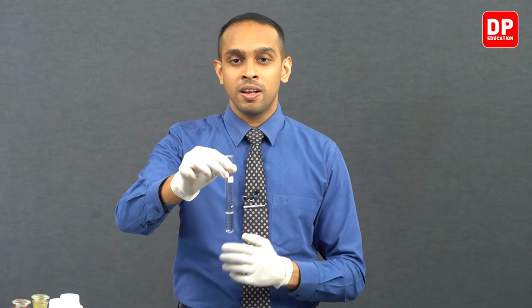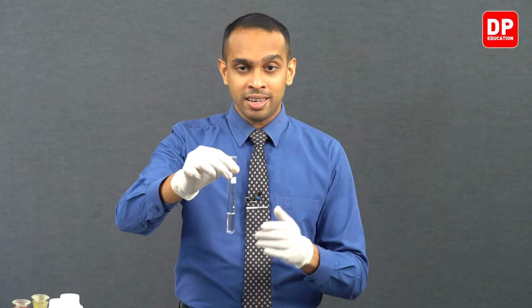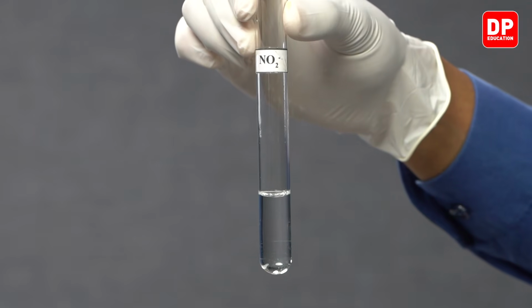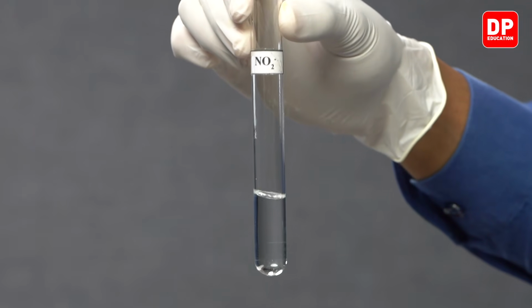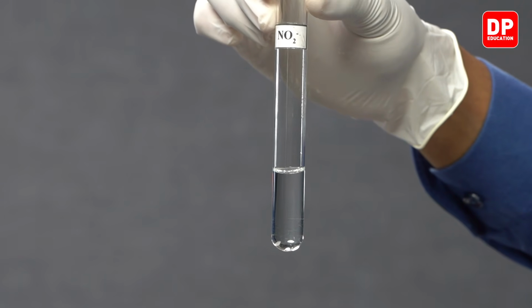So students, this is due to acidified potassium permanganate being a very strong oxidizing agent. It oxidizes the nitrite ions, and as it oxidizes the nitrite ions, acidified potassium permanganate gets reduced to form Mn2+ ions, which are colorless in aqueous solutions.